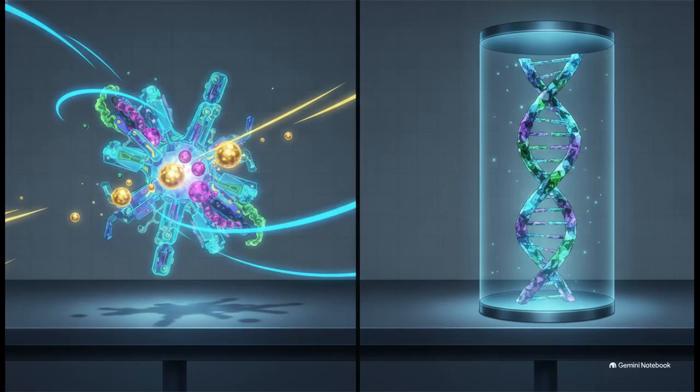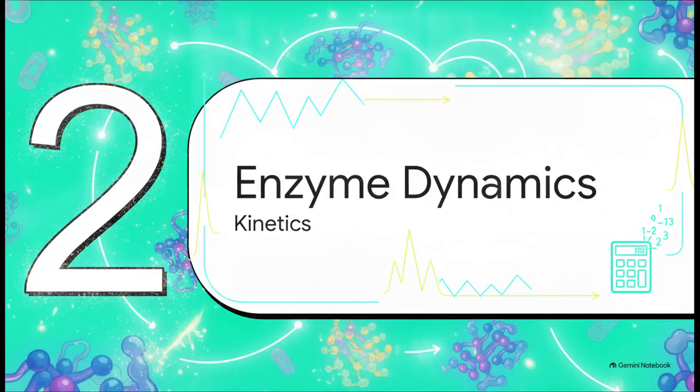So to actually understand biological systems, scientists basically have to evaluate two core things. First up is dynamics, meaning how fast are these reactions actually happening? That's the whole realm of enzyme kinetics. Second is statics, as in how much physical material is actually sitting right in front of us. That's DNA quantification. We're going to tackle the dynamic action of enzymes first, and then pivot right into the static existence of DNA. Section 2.